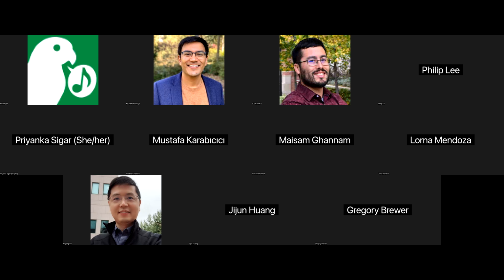I just missed where you find the human HG38 index name. Because in the exercises document it is HG19, but you checked somewhere and put here the 38 index. I copied your text editor screen, but I missed where you find it. Yeah. So again, this is all dependent on how you're saving things.